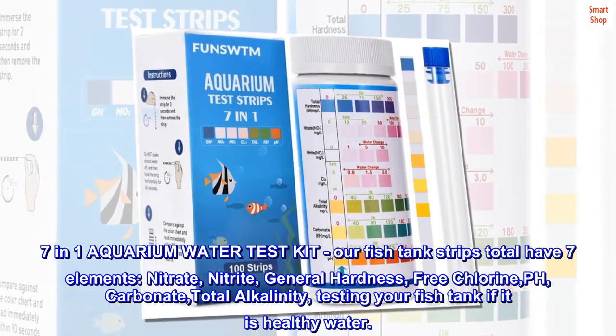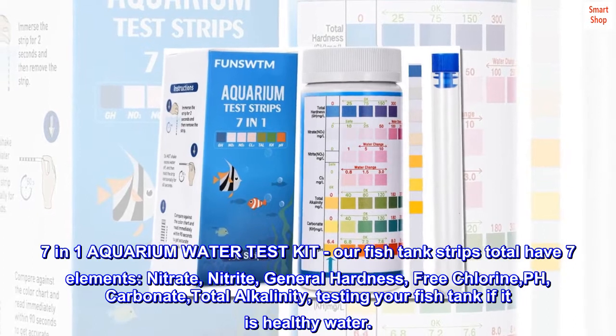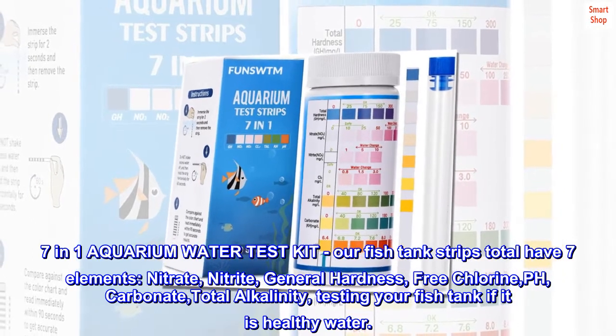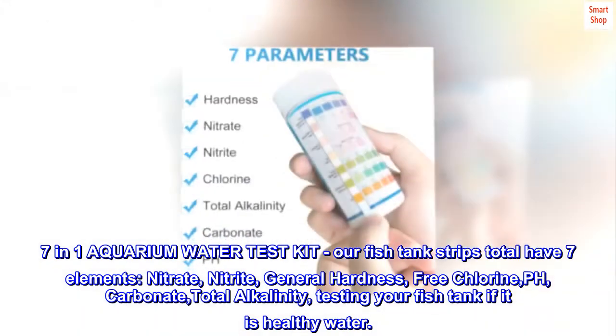7-in-1 aquarium water test kit. Our fish tank strips total have 7 elements: nitrate, nitrite, general hardness, free chlorine, pH, carbonate, and total alkalinity — for testing your fish tank if it is healthy water.